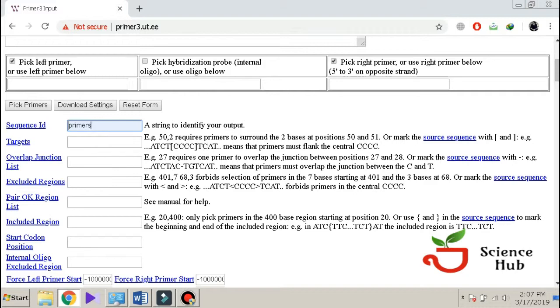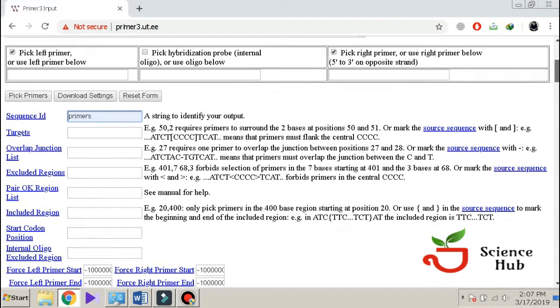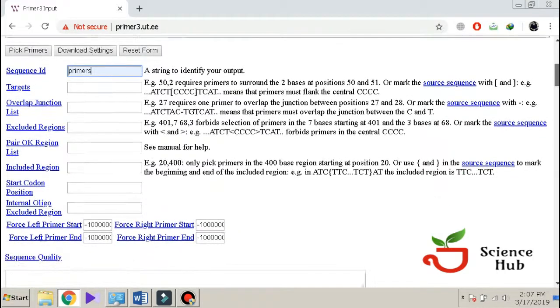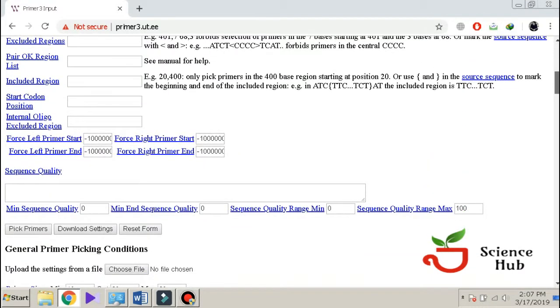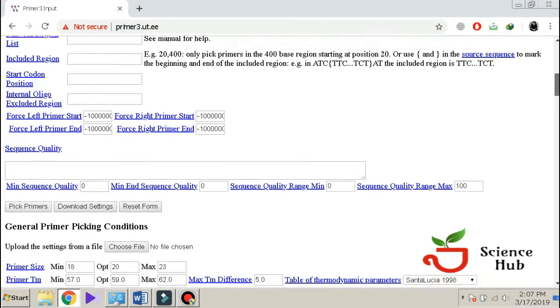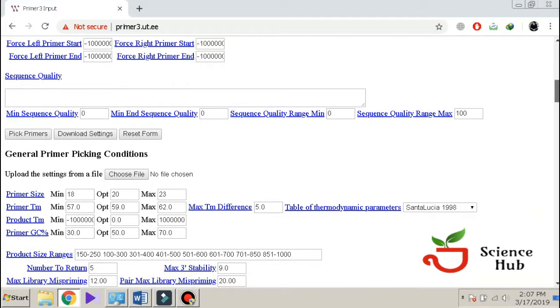But we have to only make primers for that sequence, so we leave these spaces empty.